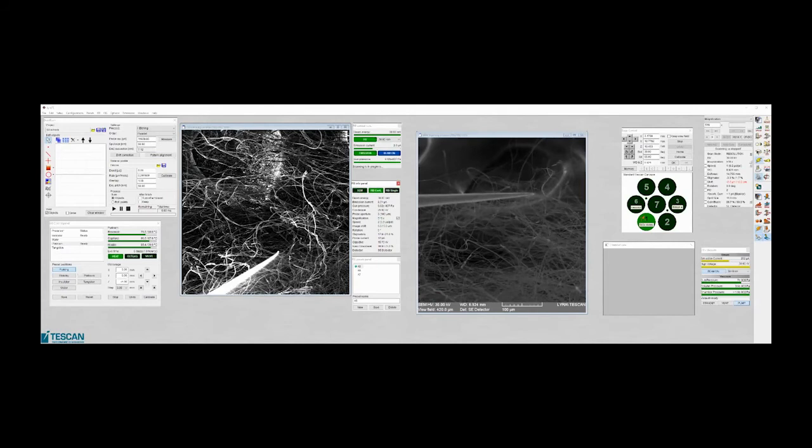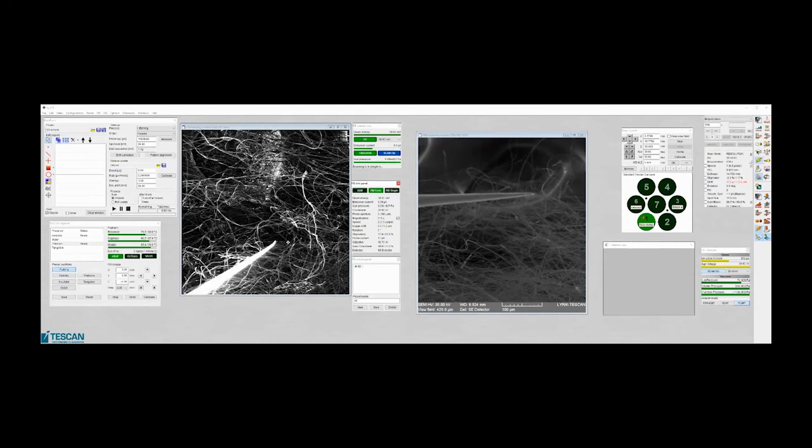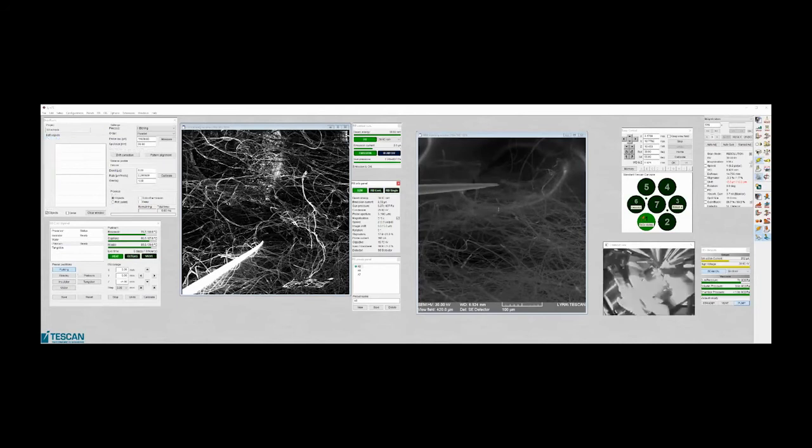Okay, we are moving. Unfortunately, we didn't touch only the one, but we touched some bunch, which was a bit higher in the Z position. Yeah, so we have something which is really up here. So now you can see it even in the scanning electron microscope window that we are moving with this bunch of it there and back.